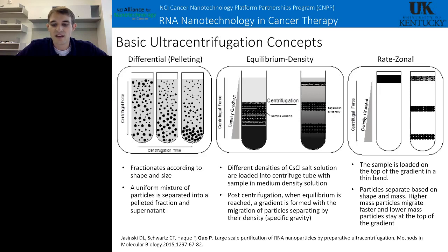And then the last one I will talk about is rate-zonal ultracentrifugation. This is kind of similar to the principle of a gel. It's the same type of thing where the particles flow continuously in this rate-zonal gradient, and they separate based on their sedimentation rate. So larger particles will sediment faster than smaller particles.